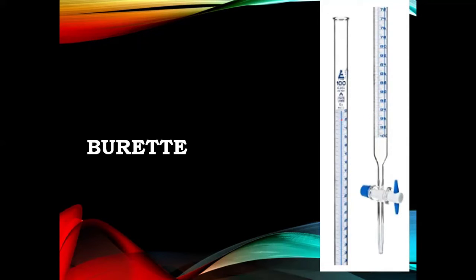So the most common burettes are of 50 ml. In most burettes, the volume written over here is the maximum volume. For example, here it is written 100, and at the top it is 0, because it is easier to calculate the volume consumed or dispensed from the tap.